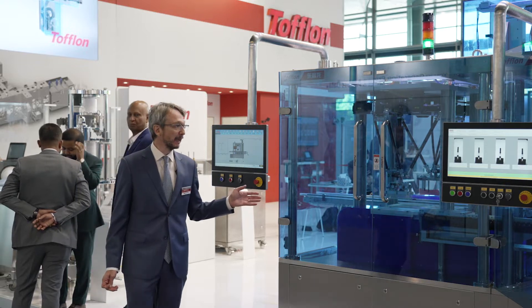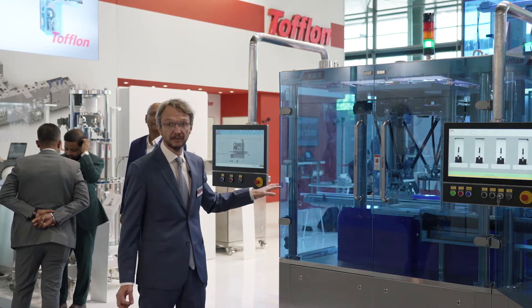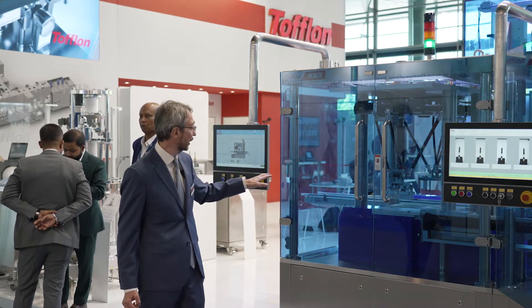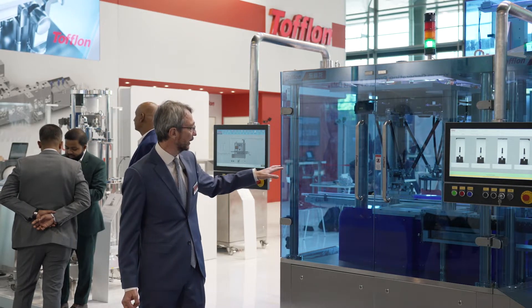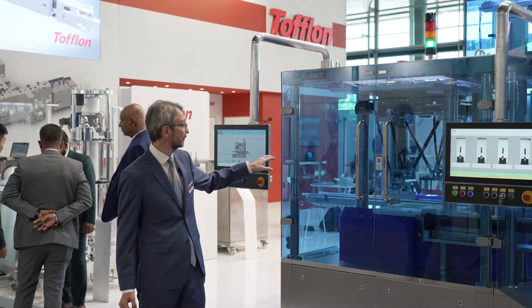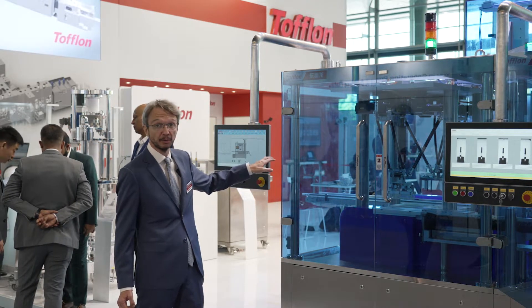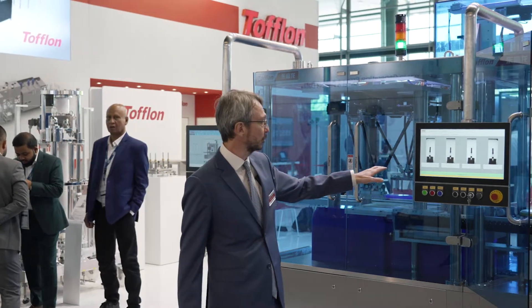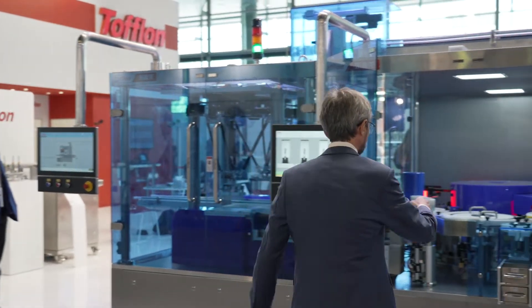This machine is made mainly by three big sections. The first section is the denesting area where the nest brings the containers to inspect in. They are removed from the nest automatically by two robots. Then the syringes are fed to the visual inspection area, here the main carousel.